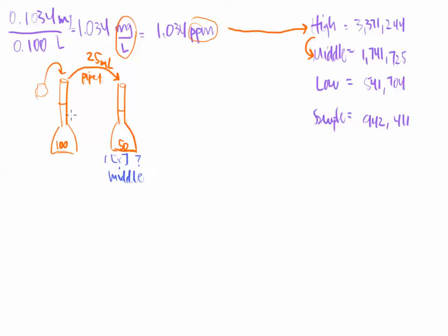Well, think about it for a minute. I took this liquid and I diluted it to make this liquid. That's a very key word, diluted. That means dilution, right? So the dilution equation that you are accustomed to is MV equals MV. But guess what? The M's can actually be C's. And the C stands for concentration.